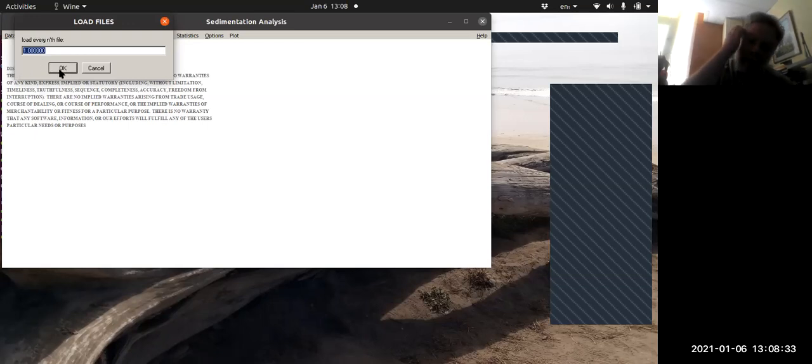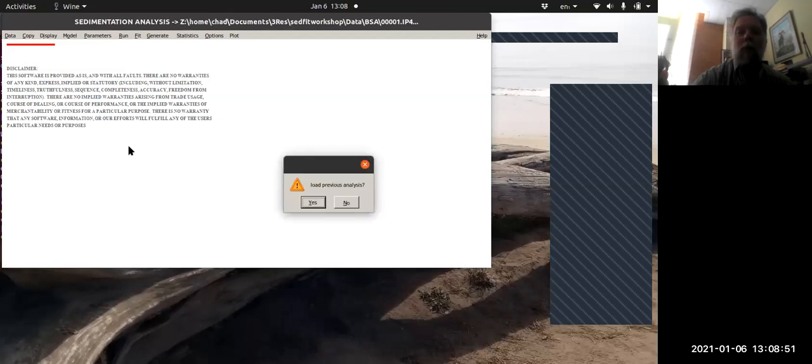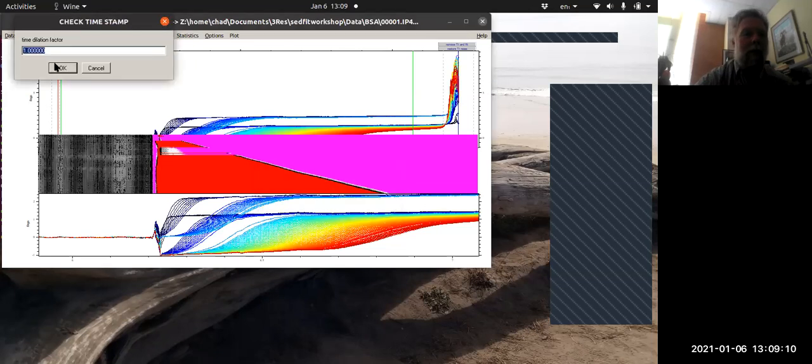My laptop was probably worth $1,000 way back in 2010. So it's probably worth $100 now. I would not use too much more than 100 scans for most laptops, even today. You could probably eventually use 200 or 300 scans, but I would use that window that I just clicked on to divide up the number of scans you look at initially, because you will be fitting and refitting this data multiple times. I have a previous analysis in it, but I'm not going to load it this time, so you can see what it looks like if you just want to deal with things from the very beginning.